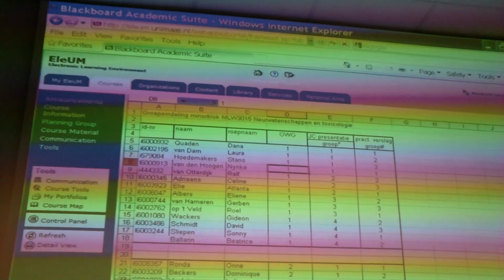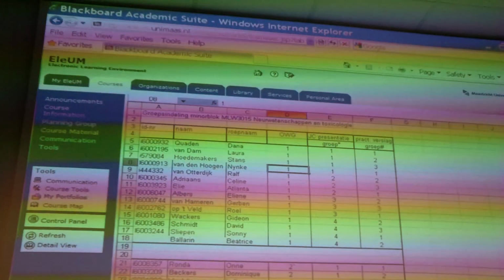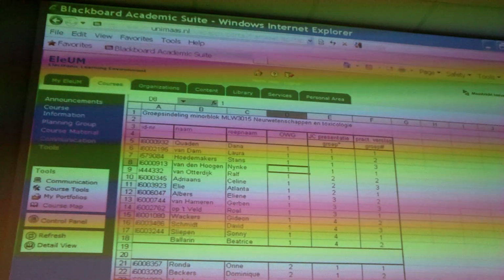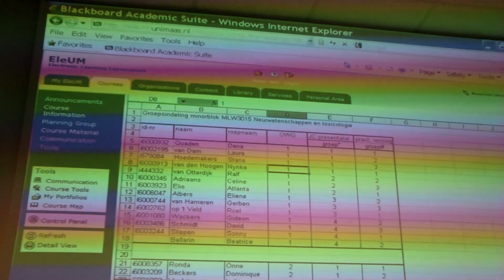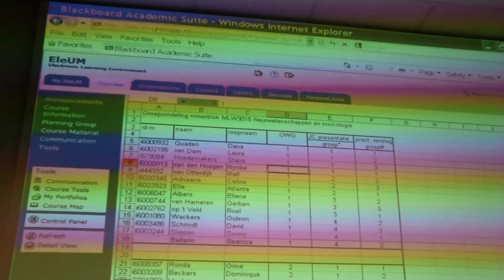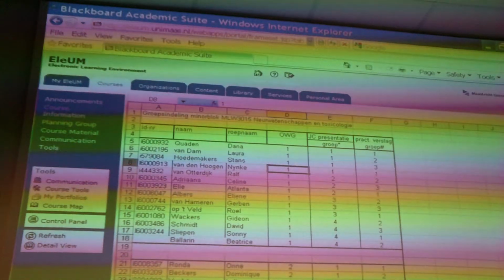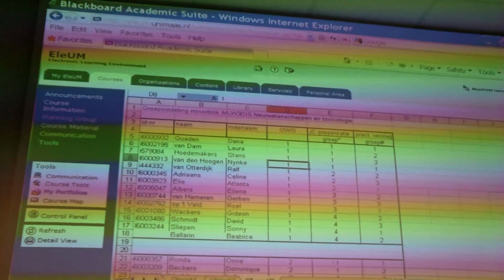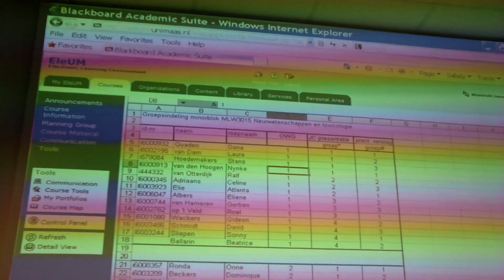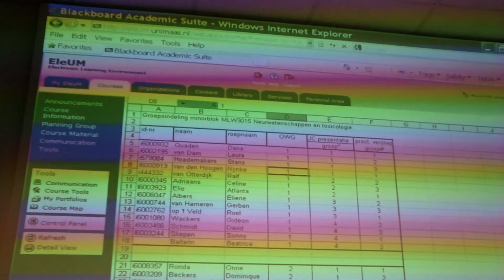And to make sure that this is going right, we'll meet again this afternoon to see if you're going the right way. That's the purpose of the setup discussion. So tomorrow morning, when you go to the lab and you get your 2 samples and the tube with a standard concentration of 1 gram per liter, you will be able to find out what the concentration of your sample is.